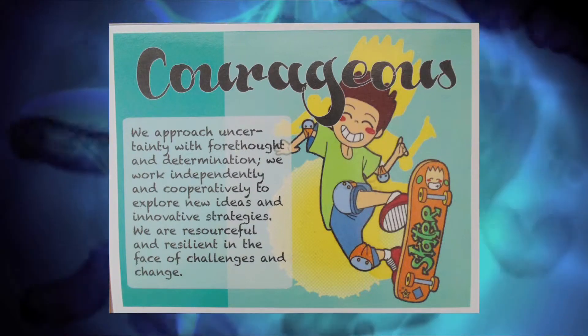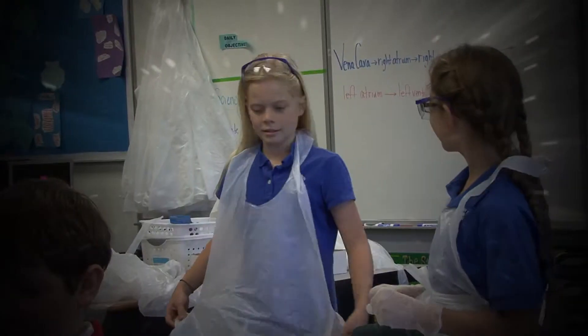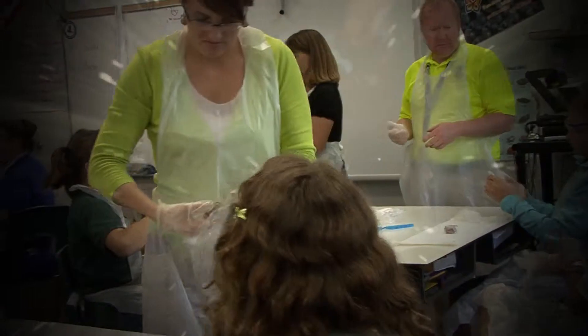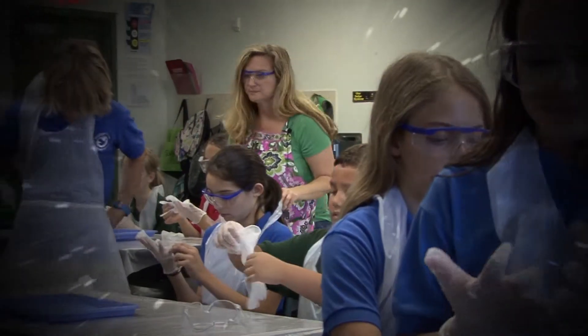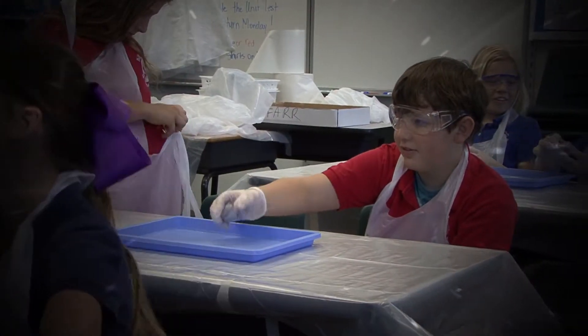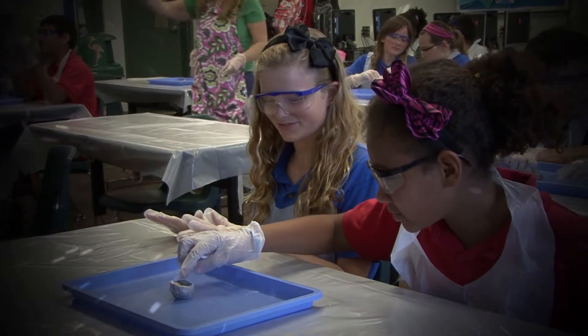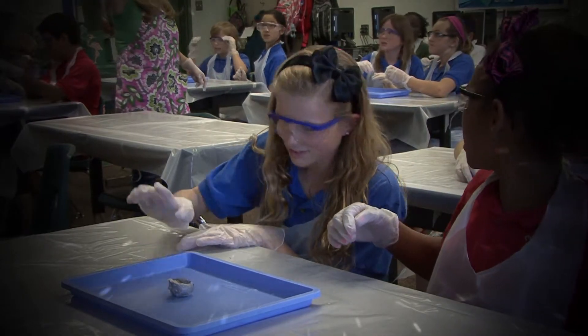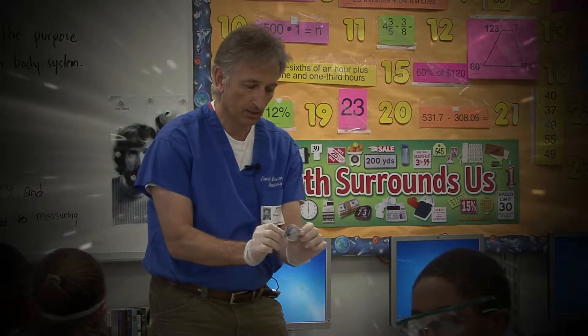When we make the first cut, it is going to squirt, so keep it down in the tray. Everybody understand? Safety goggles on, safety gloves on, apron on. Everybody's got a pair of scissors, everybody's got a tray, and everybody's got a cow eye.